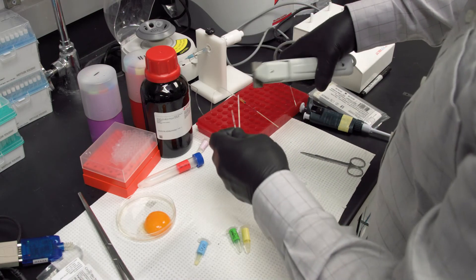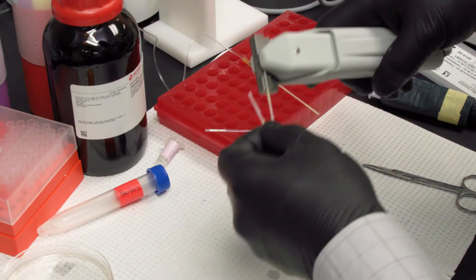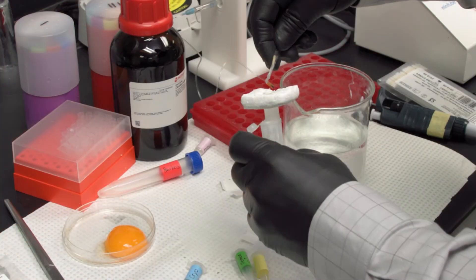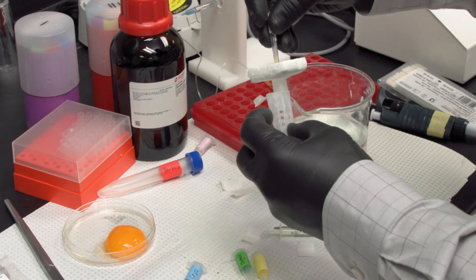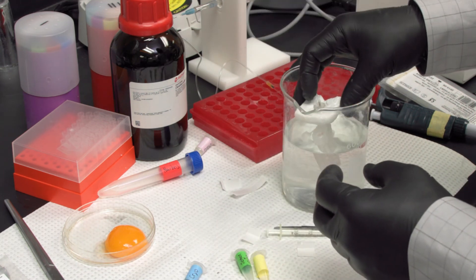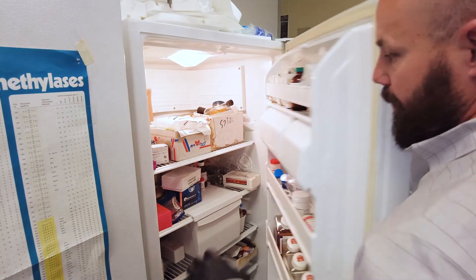The straws are then sealed and labeled. The straws are then floated in a room-temperature water bath, which is then placed in a 4-degree Celsius refrigerator to allow the semen to cool slowly.